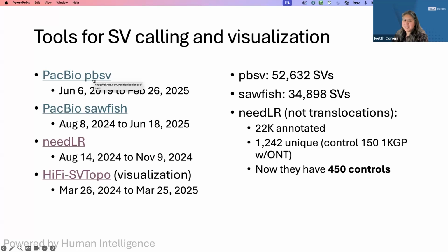So the problem with that is that to do analysis, a lot of that step is manual. So we have to narrow down to a set of variants that are possibly pathogenic, and we do that by overlapping with common variants, as I was mentioning. That's why we use gnomAD.